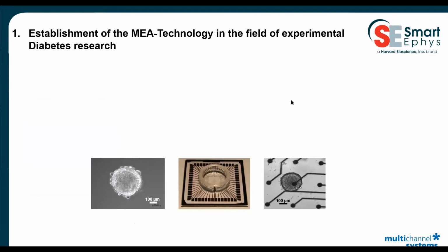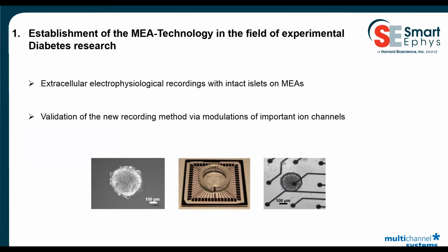Let's come back to the islet recordings. I would like to introduce you to the establishment of the MEA technology in the field of experimental diabetes research. I want to show you what extracellular electrophysiological recordings with intact islets on MEAs look like, and how we validated the new recording method, of course, with modulations of important ion channels.